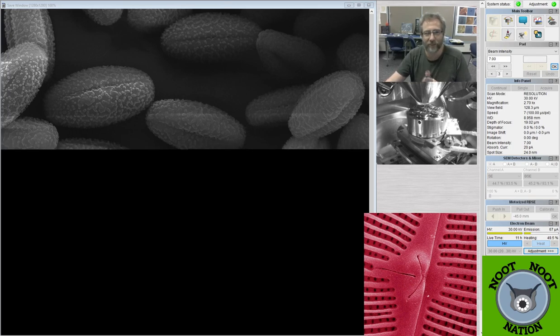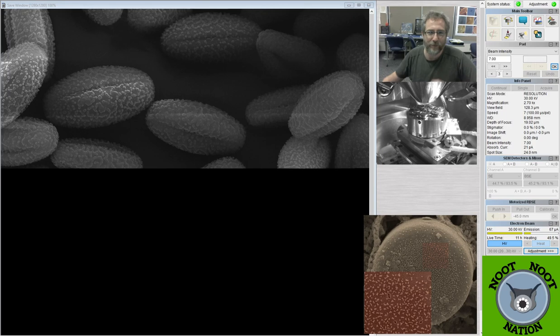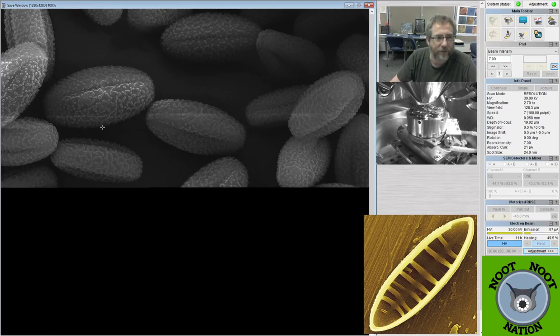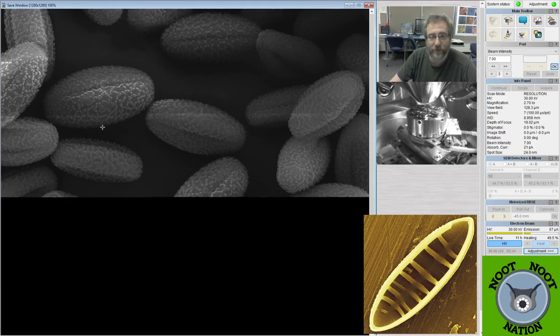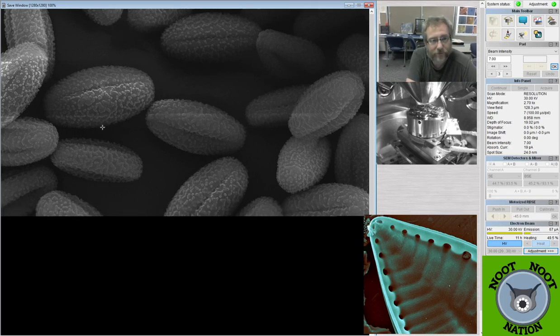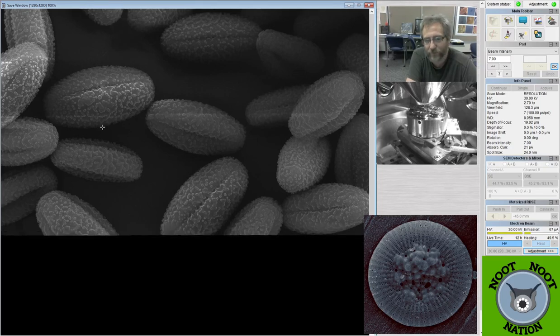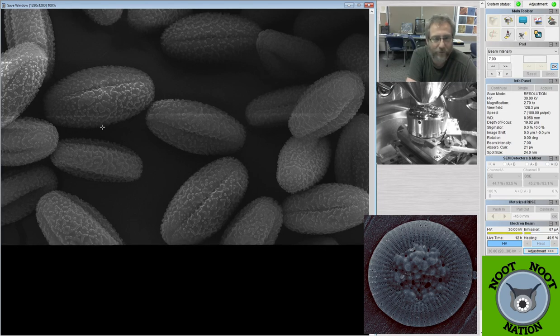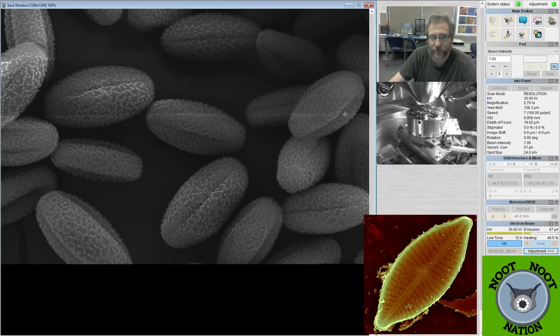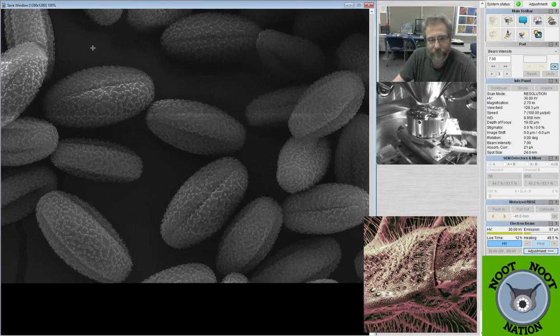Ah, oh man, look at that. Got a charging line going across the middle of there. Yeah, it looks pretty, but I'm also complaining about this thing right here, this little line going across the stage. I'm gonna have to get another picture now. I'm gonna be forced to take another picture of this stuff. It is super pretty though. Just one little line. I might just manage with it. Crop it, no one can tell. Or I could Photoshop it maybe. Although it's because there's a high point over here. You can see there's a little bit of a charge right there, and it's dragging through the whole stream when it goes across. The rest of it looks good, though. So maybe I'll keep it.